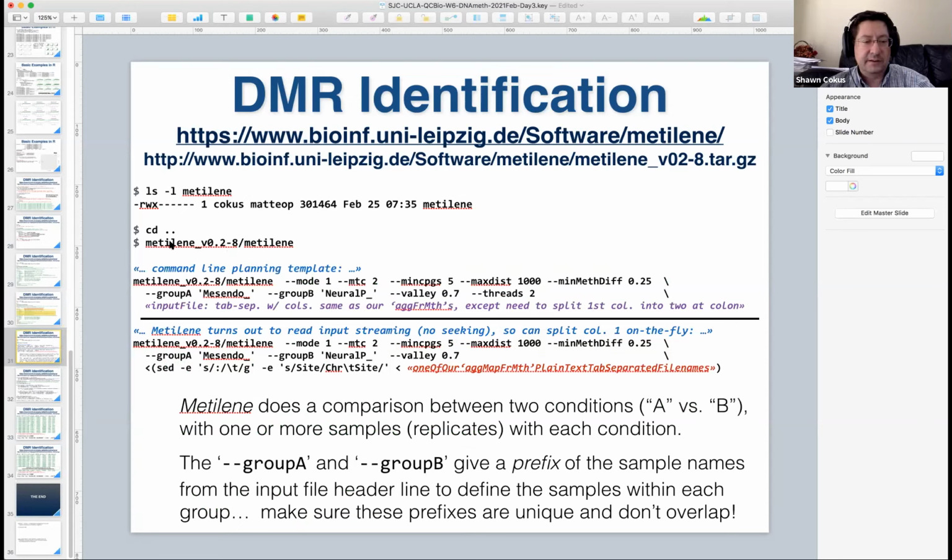All right, where are we now? Okay, so here's our usual thing. I'm planning out the template that we're going to fill in with parameters to see how this goes. The command line we're going to run is going to look something like this.